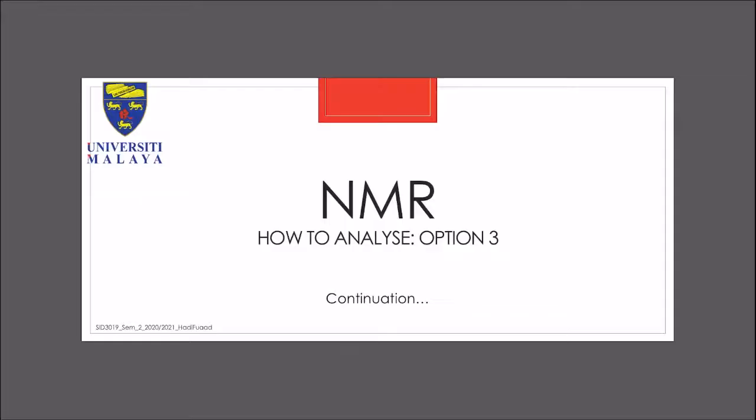Last week we did a revision on NMR spectroscopy. We looked at different 2D NMRs, particularly COSY, TOCSY, and a few others.